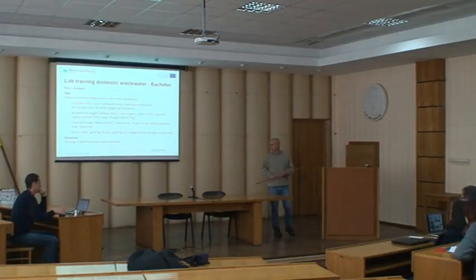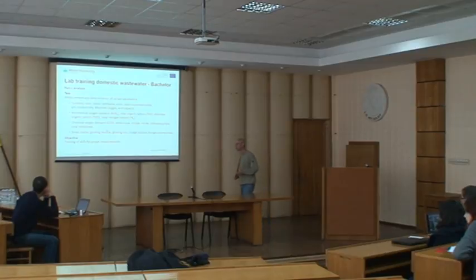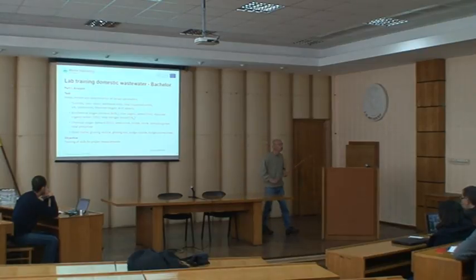So let me give a little bit of overview of what we are doing in the laboratory. This is a lab training of the domestic wastewater for the bachelor. This has been carried out by Martin Oldenburg, so some of you might know him. And the first part is an analysis. How are certain parameters being determined?